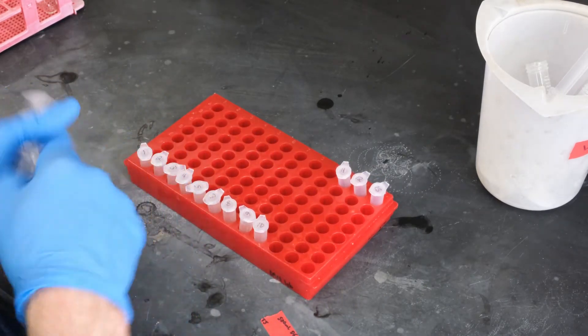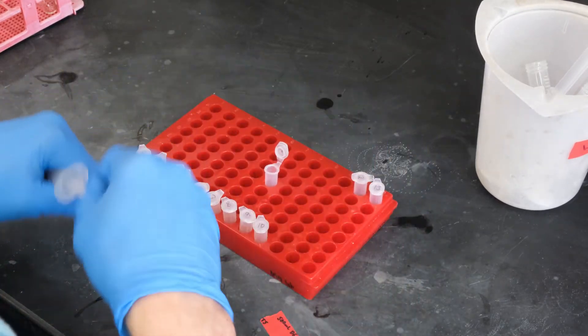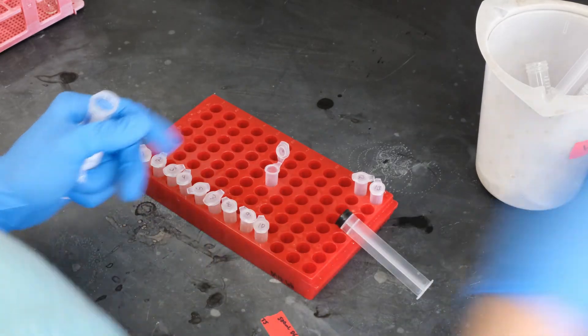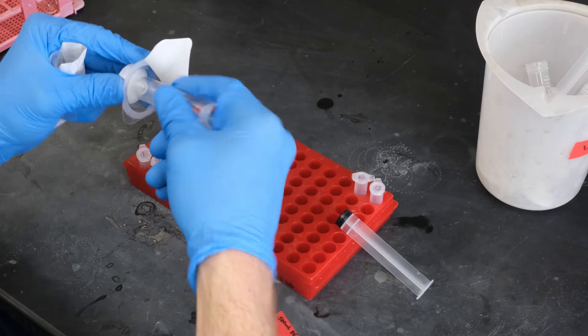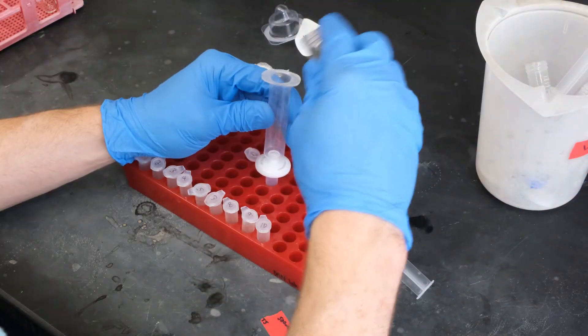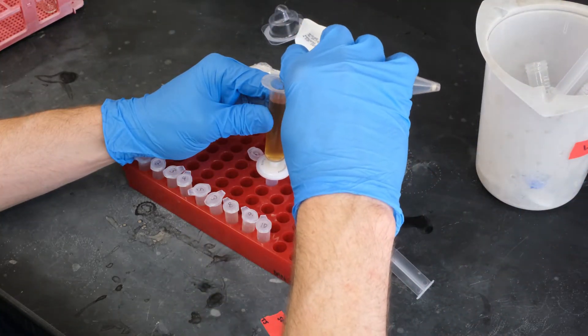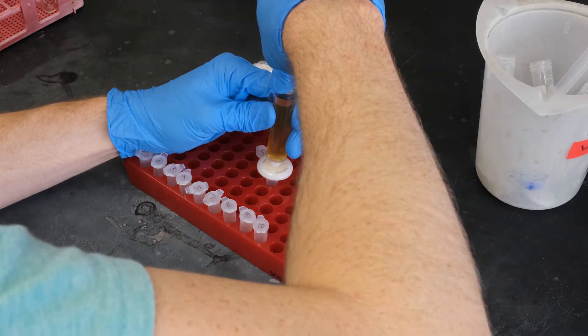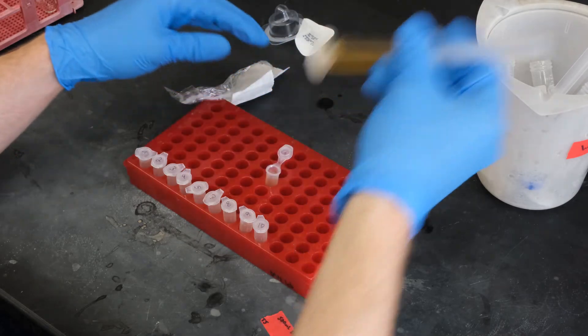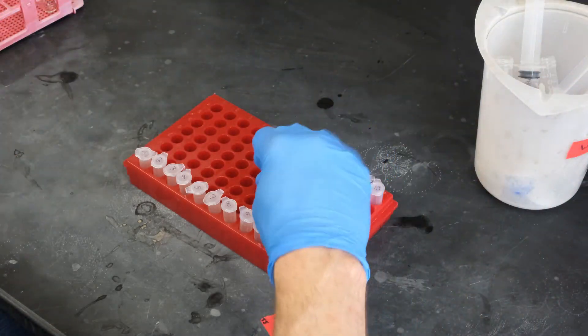To recover sample supernatants, attach a 0.22 micron filter to a 3 mil syringe and remove the plunger. Pour that supernatant from the 15 mil conical into the syringe, then push the sample from the filter into an epi tube or a new 15 mil conical vial if you want to collect a larger volume. Repeat this for all your samples.